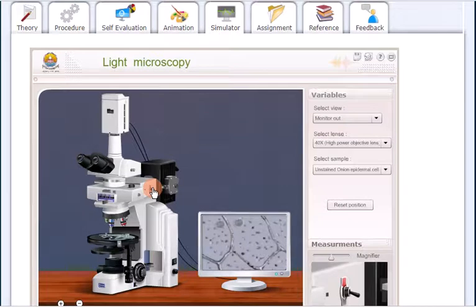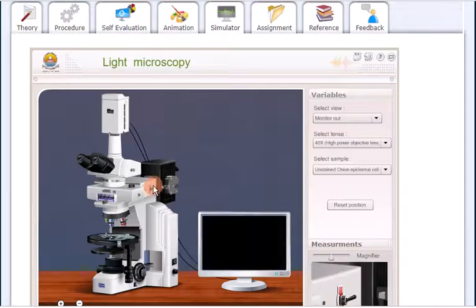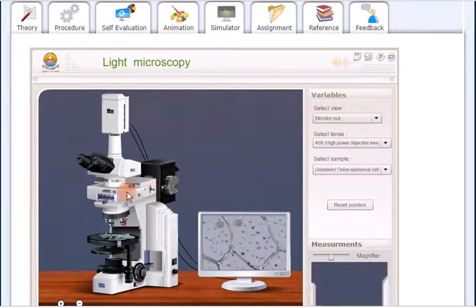This is giving a power. So you see this is making this off and this is on. So be careful in selecting some of the tools you can use, and you need to be very careful while setting. So you can do this.